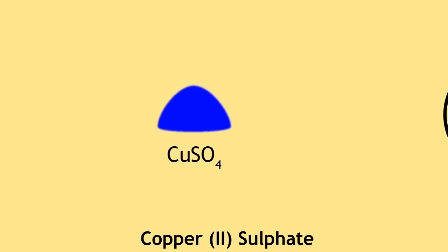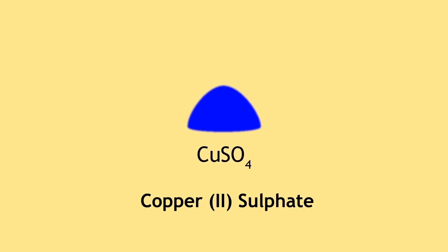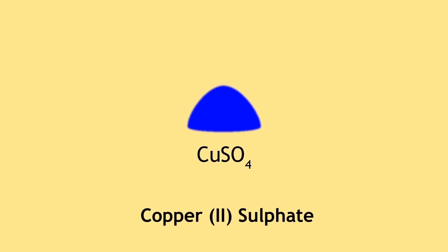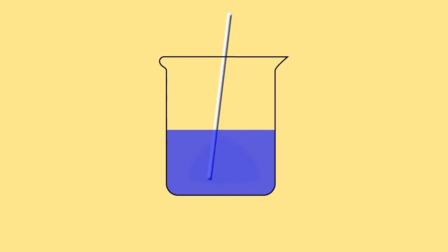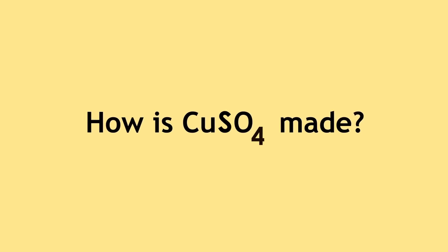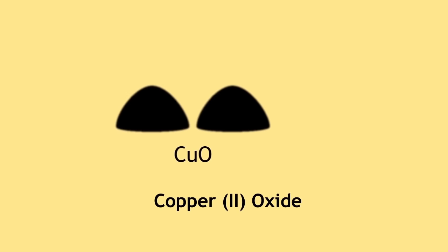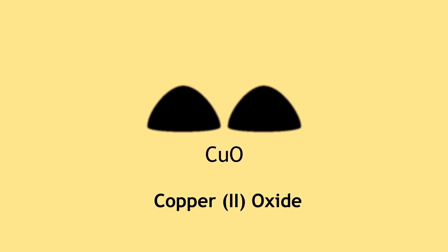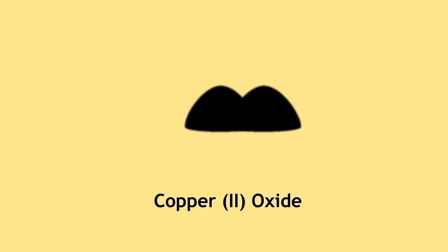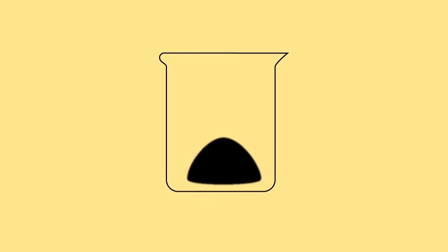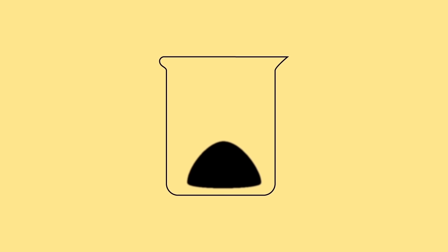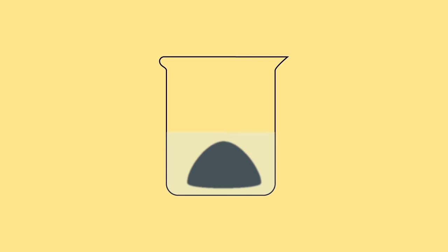You have likely encountered copper sulfate either as crystals or in solution, but have you ever wondered how it is made? Did you know that you can make your very own copper sulfate crystals? Add two scoopfuls of copper oxide, which is a black powder, into a beaker. Then add sulfuric acid so that all of the copper oxide powder is covered and a bit more. Mix with a glass rod.